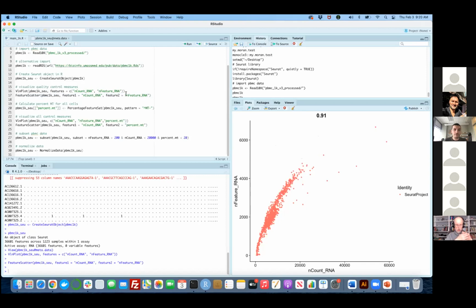Before moving on to filtering out these cells, we are going to introduce additional material. As we discussed in the last session, if cells are in an apoptotic state, we might have been capturing some RNA from the mitochondria. So you'll be seeing a lot of reads aligning to genes starting with MT-. What we are doing here is calculating the total expression and UMIs from genes starting with MT-, divided by the total UMI count for each cell.